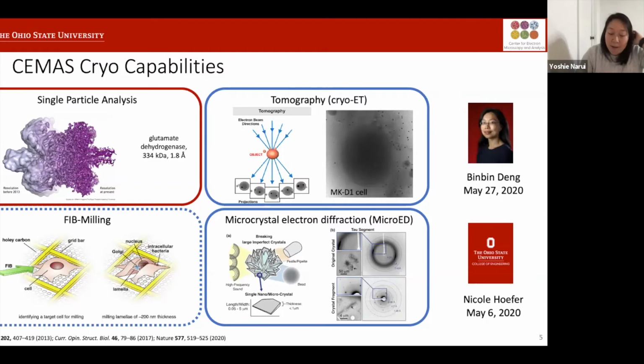As I mentioned, I'm going to be talking mostly about single particle analysis. And when I say single particle, sometimes people get a little confused about what that means. Particle in this sense refers to a protein or a macromolecule. It can contain DNA, RNA, different types of ligands or small molecules. And that particle has been cloned, overexpressed and purified, usually from bacteria or mammalian cells. So it's a single species or sample that exists in solution.